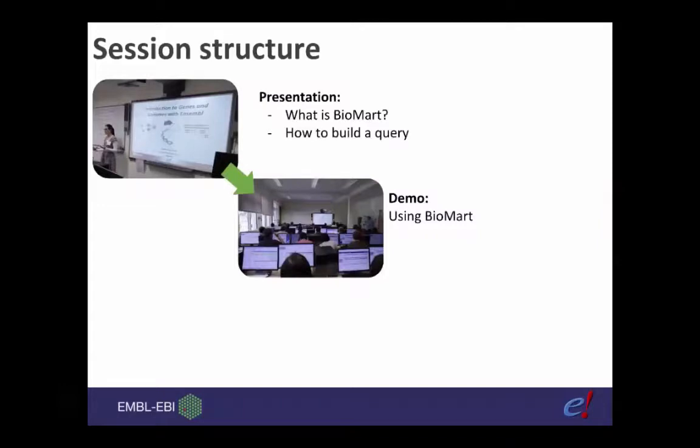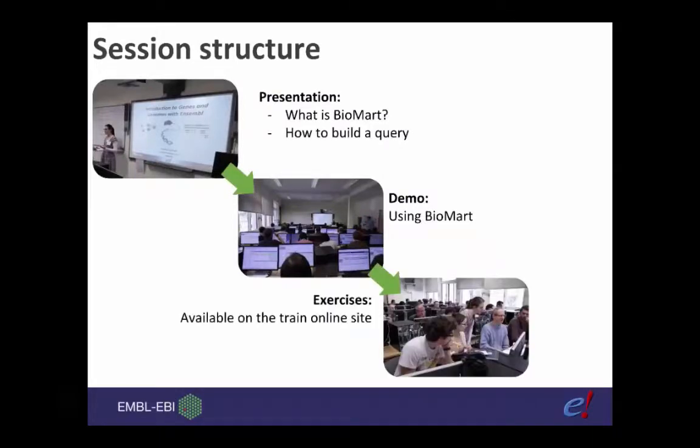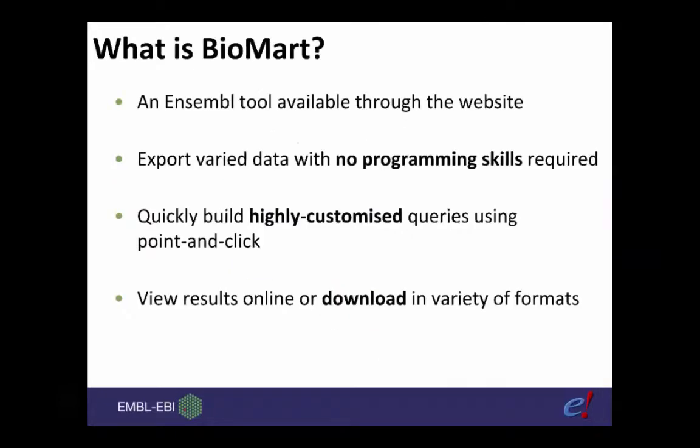Okay. And so this session is going to follow the same structure as the others. We're starting off with a short presentation about what BioMart is and how to build a BioMart query, and then I'll show you how to do this in practice in the demo. And then, as we know already, we have all the exercises available on the Train Online site for you to do after the webinar. So let's start by defining what BioMart is.